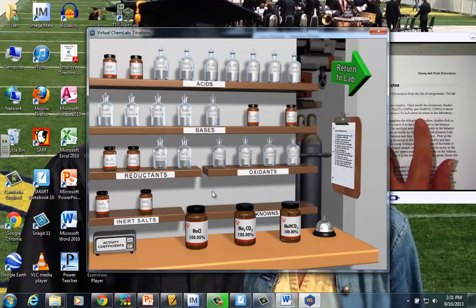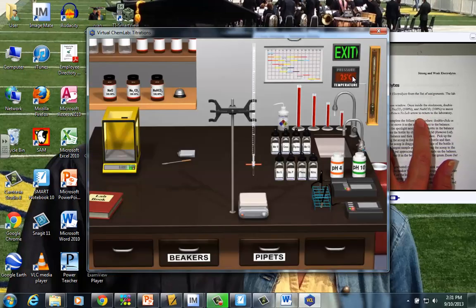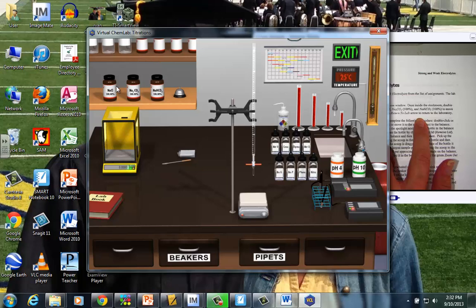And it says click the go back to the lab arrow. So I'm going to head back. Notice where the three reagents now are just sitting in the window of the stock room. And this is our lab bench.